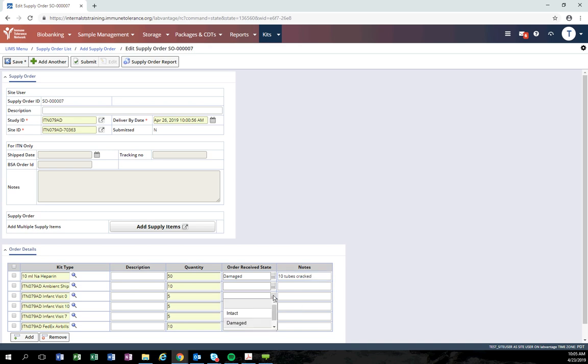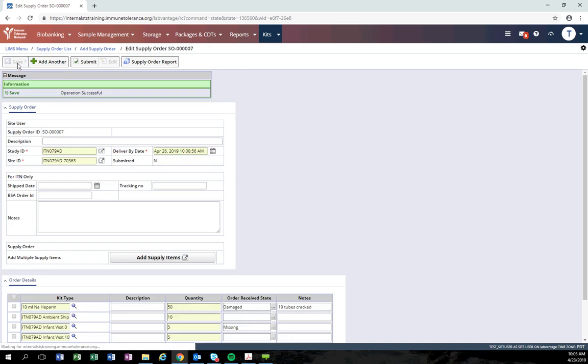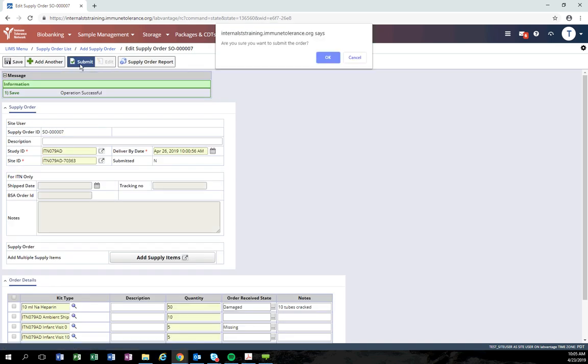If an order is completely received without any issues, you do not need to enter the information about the received status. We ask you to only enter information for issues with an order. After you've entered the received state issues and notes, be sure to click save and the submit button.